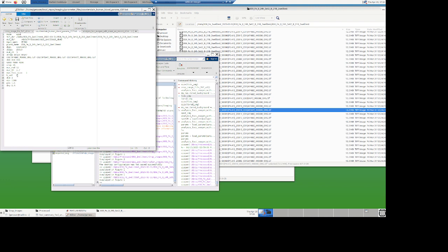The k-value is the k-value for wavelet. 4 is the right value. You can even pick more. If you go to 3, you don't want to go below 3, it doesn't work. The k-value can't be below 3, but it's an integer. The higher the number, the more stringent you are, so the more perfect the spots need to look. So 4 has always been a good number, and I haven't touched this for years.